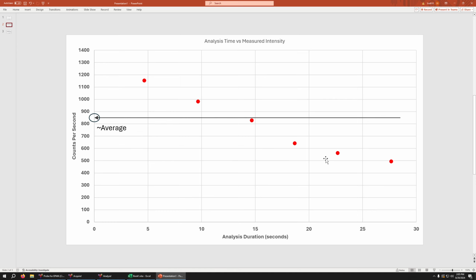We want to know what the intensity of the sample would have been before the beam started interacting with it, in its natural state, quote unquote. So something like this is what we really want to know. We want to know what it would be at time 0. Now, fortunately, PFE has some pretty robust mechanisms for dealing with TDI, and that's what I'll be showing you here.